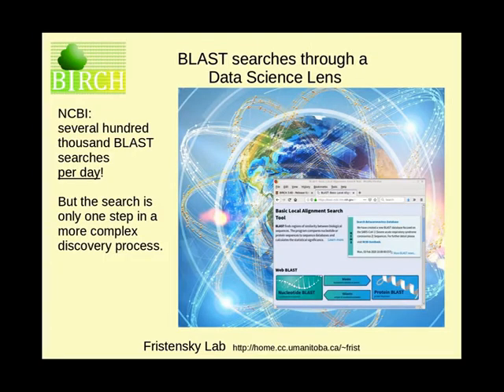Most of you watching this video have done BLAST searches through the NCBI website, and although NCBI has a powerful cluster of servers, this is offset by the fact that NCBI processes literally hundreds of thousands of searches every day from users worldwide. It's often the case that you'll get a faster turnaround on BLAST searches done on your local computer. More importantly, I'll demonstrate the advantages of running BLAST through BioLegato.